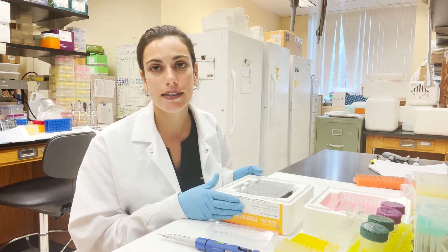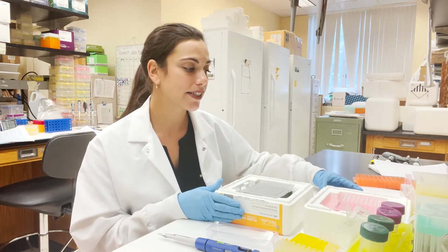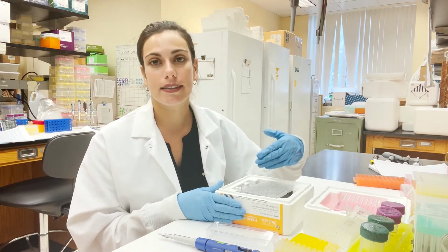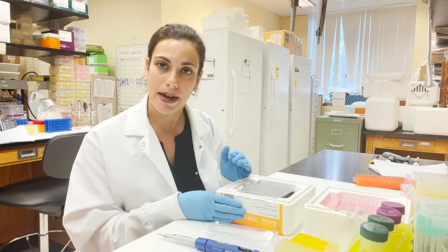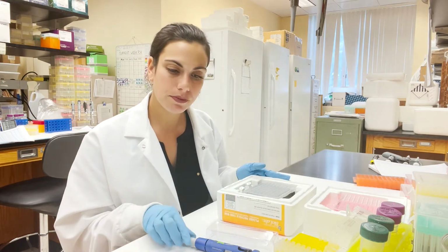Okay, so the first part is we'll make our master mix with all of the ingredients except for the ligase. The ligase is really sensitive to temperature, and it'll take a little bit of time to put the digest and the adapters into our 96 well plate. So we're going to add our master mix actually in the later stages so that we can have our ligase sitting in the freezer for as long as possible. But we can prep the rest of the master mix in the meantime to save some in-between time.